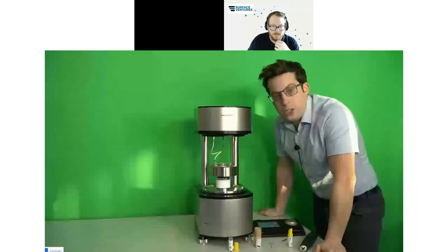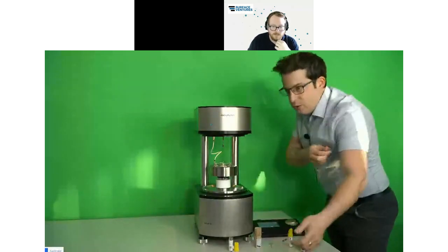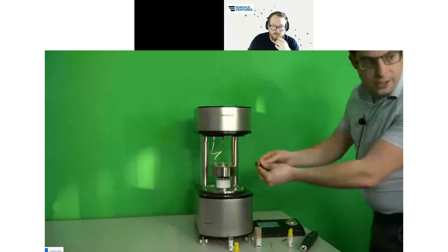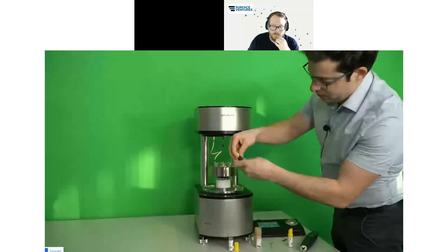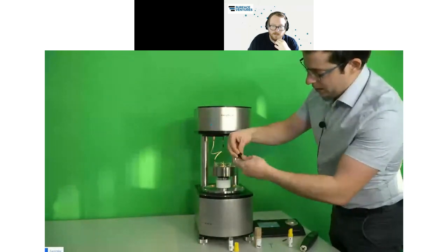If you want to measure fiber bundles, like a piece of my shirt, for example, then we are using a different type of holder. I'll show you quickly. This one here. For fiber bundles, we have this kind of pipe, and you can screw it up on the upper end. And I want to show you. Hey, there's a long screw.